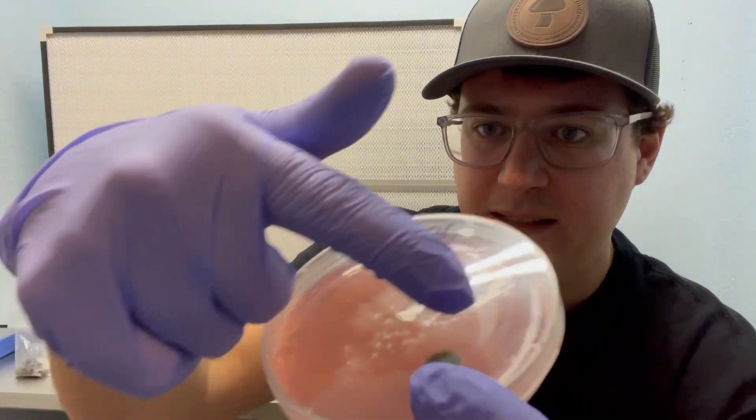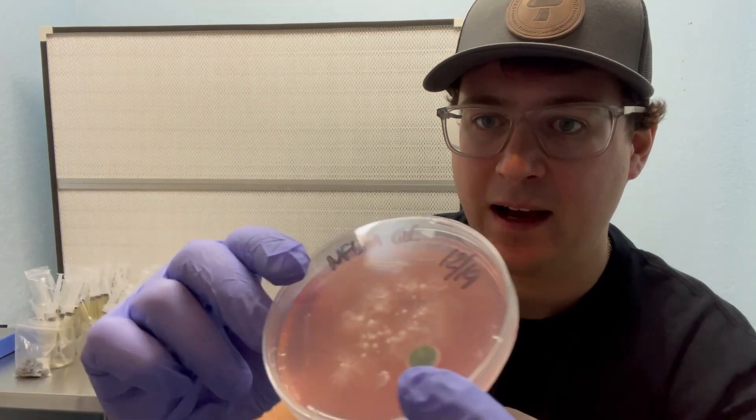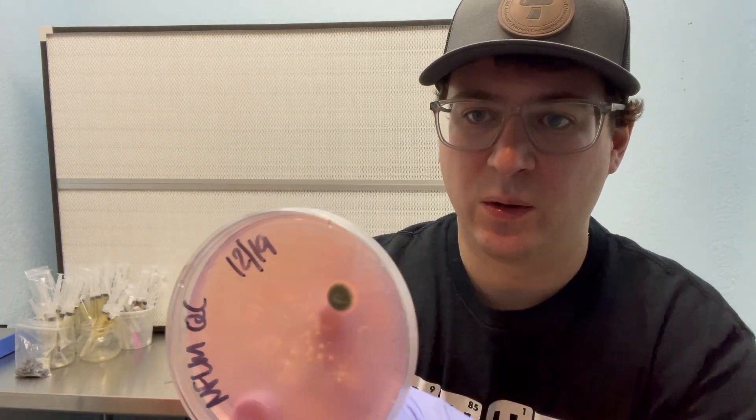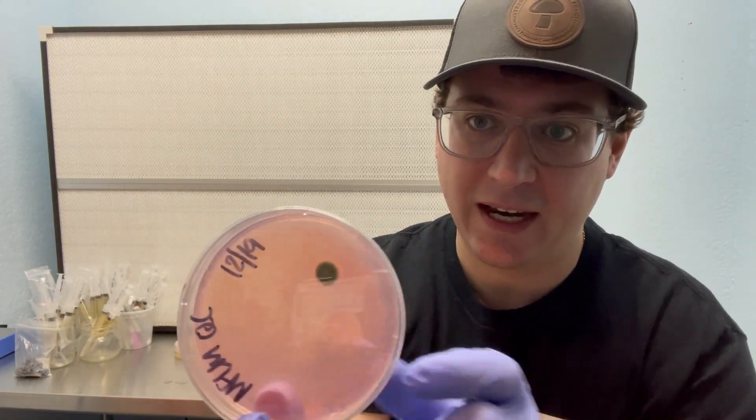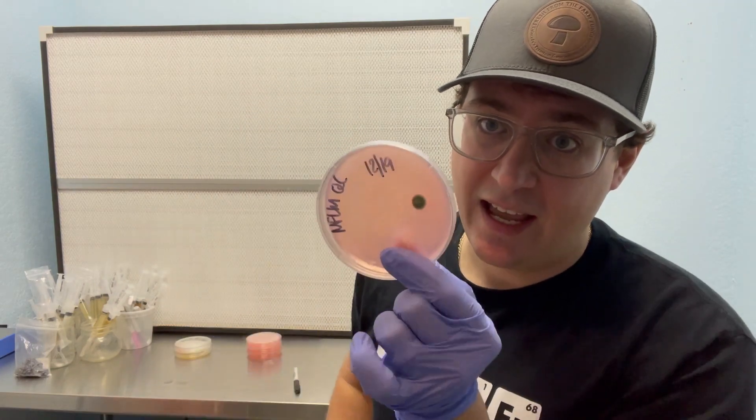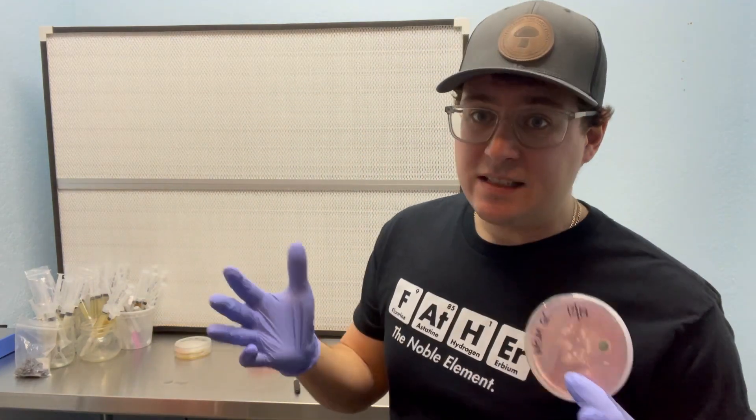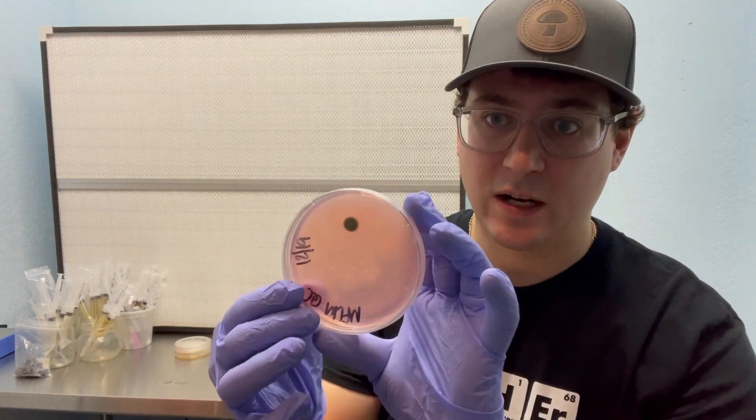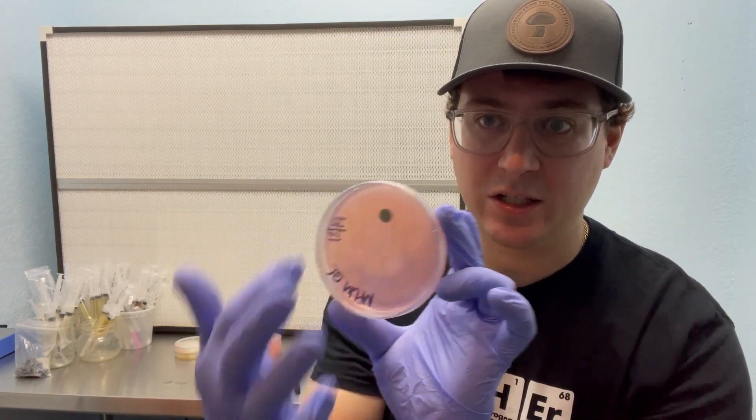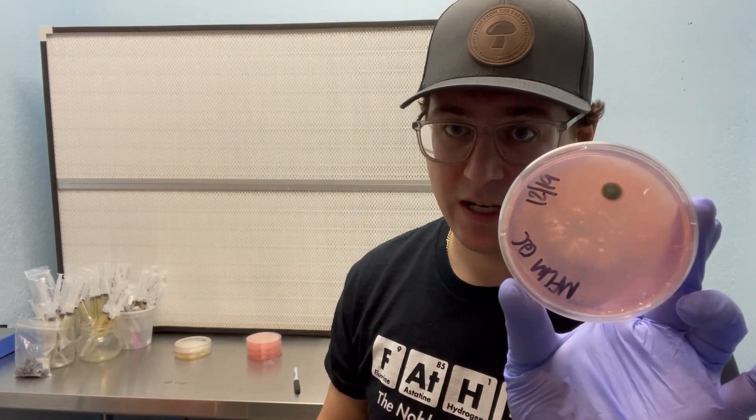So you can see the lion's mane mycelium is growing. However, there is a little spore of what looks like some penicillium that got into this petri dish and is growing. So your instinct as a new mycologist might be to try to cut out that blemish and preserve this dish.